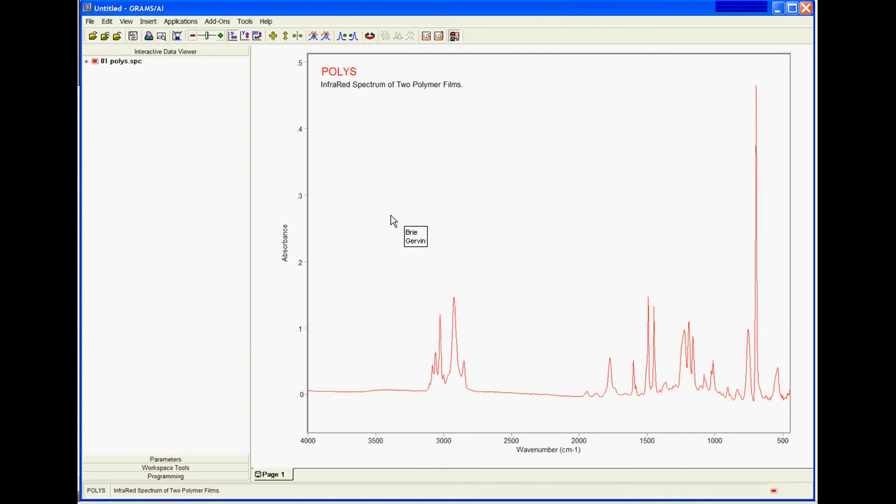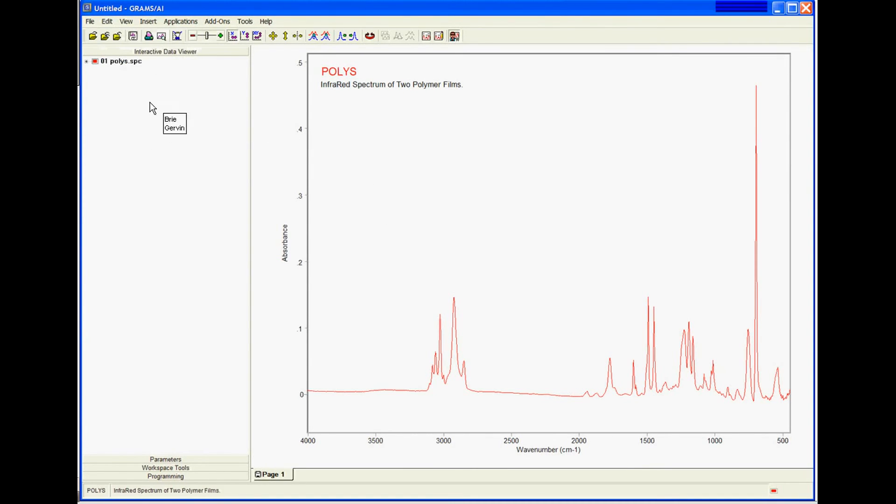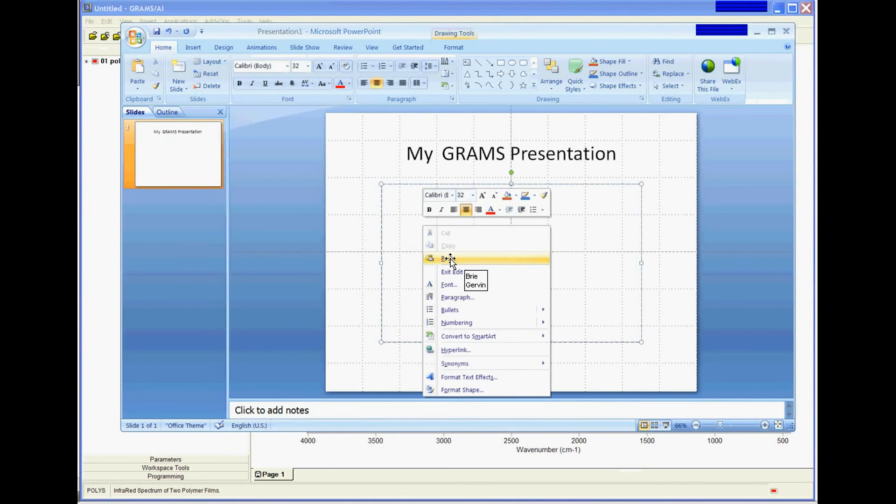I'm going to copy this now into PowerPoint. Edit, copy. Go over to PowerPoint, right-click and choose Paste.